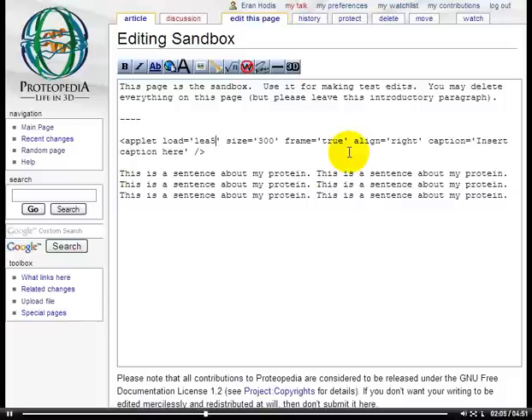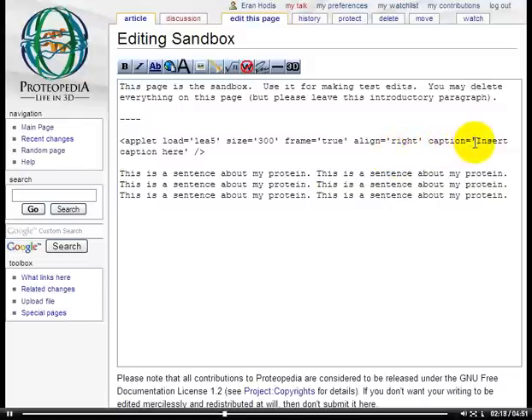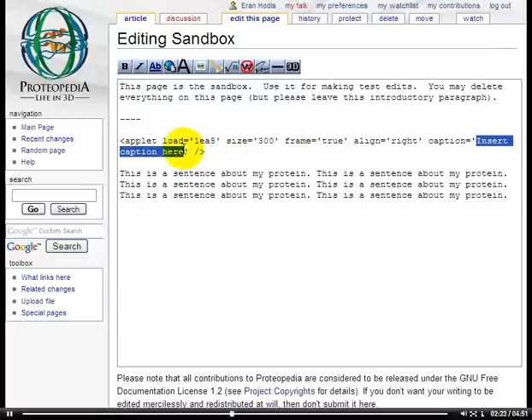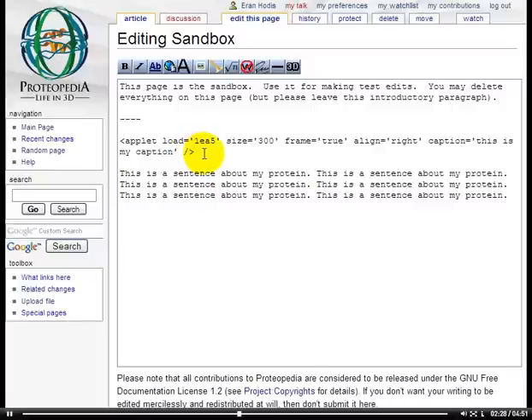You'll see what I mean in a second by that. If we do have the frame, then that allows us to align the applet either right, left, or center on the page so that the text will wrap around the applet in an appropriate manner. And finally, here we have a caption. We can change this to say whatever we wish. So let's say, this is my caption. And then the closing tag right here, signifying the end of the applet.